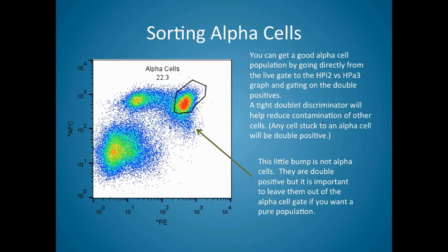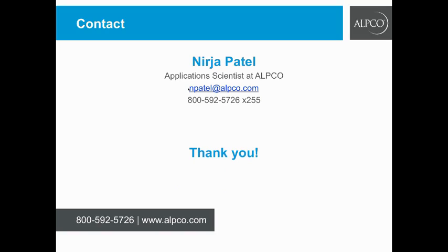Okay. I just wanted to reemphasize the last point that Pam was making, and that is that you do want to avoid cells that are down, say, in this area here on the plot. Again, there are different endocrine cells, and also this kind of mix of cells that are between these two populations. You would like to make a tight gate around the alpha cells there, and then you will actually achieve a very high enrichment of those alpha cells. So I guess from there, we maybe hand this back and try to address some questions.